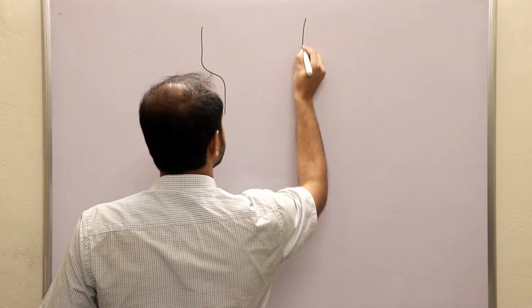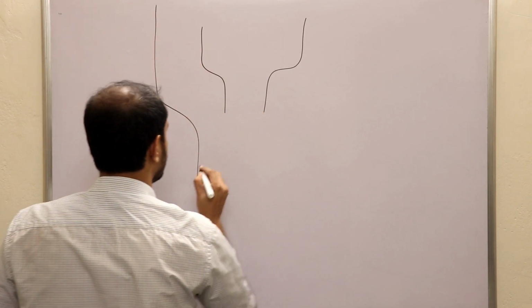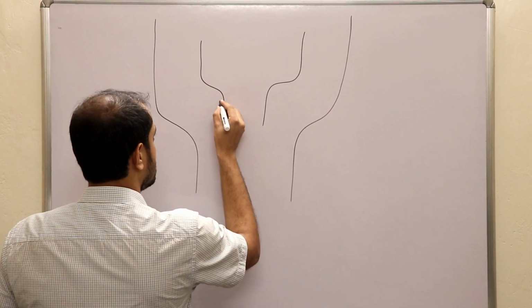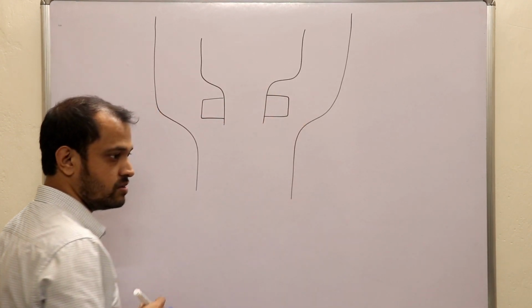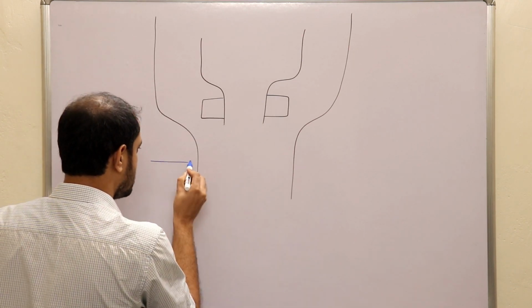This was your compartment where you will have to put your cell suspension. This is your sheath fluid suspension. This was your vibrator, which actually follows the piezoelectric effect. Now listen with all your attention here.